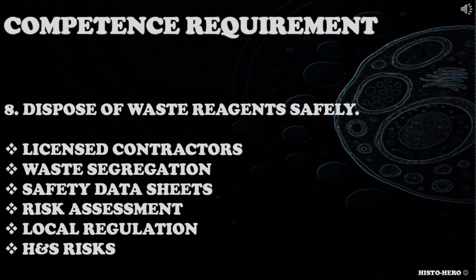Consider licensed contractors used by your lab, waste segregation, safety data sheets of reagents that often state disposal ways, risk assessments, local policies and regulations that are followed, health and safety risks associated with reagents like flammability, corrosivity, environmental toxicity.